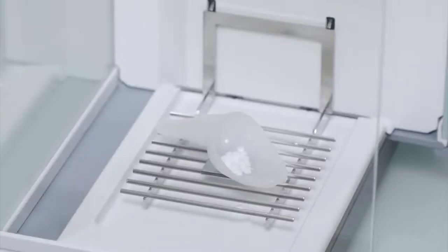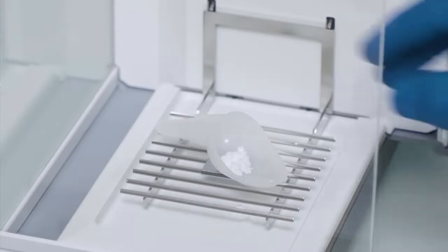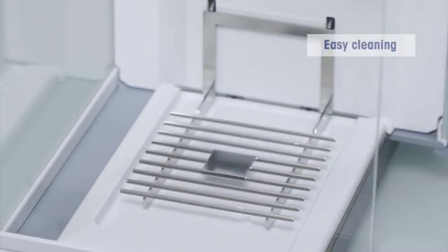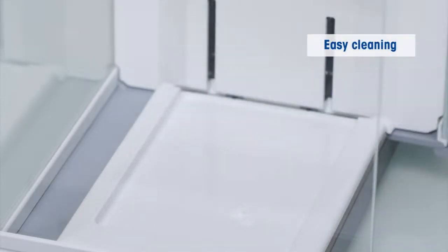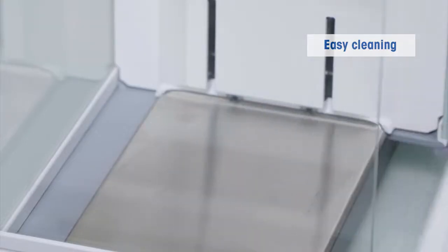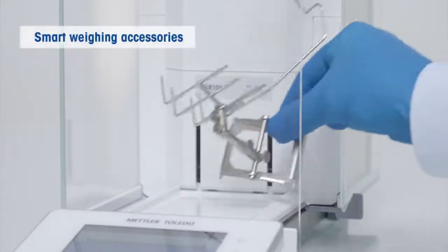The smart grid weighing pan further reduces influences of draft and makes sure that spills fall through the grid and are not added to the result. So let's start weighing.